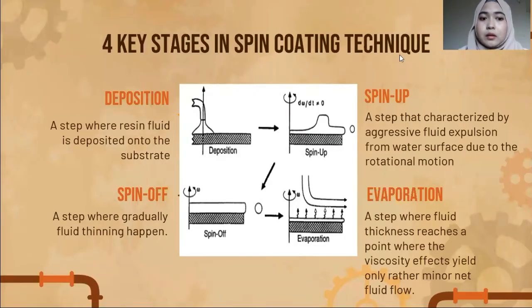Next, the third stage is spin-off, a step where gradual fluid thinning happens. The substrate spins at a constant rate, and fluid viscous forces dominate the fluid thinning behavior. This is called fluid thinning.